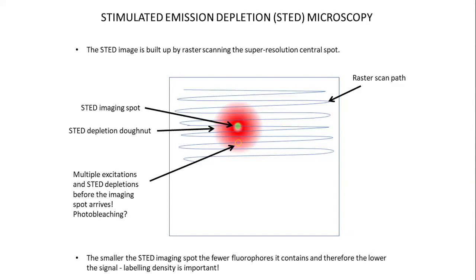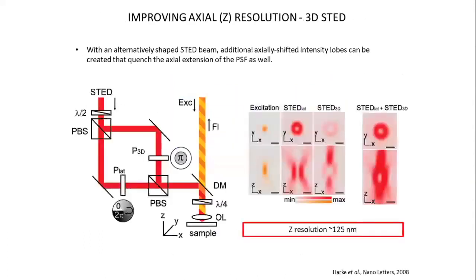How it actually works is shown in here. We start with a regular confocal microscope, this beam path here. The excitation light comes in and the fluorescent light goes back out to the detection optics somewhere in the confocal scanner. Superimposed on that is this guy here.